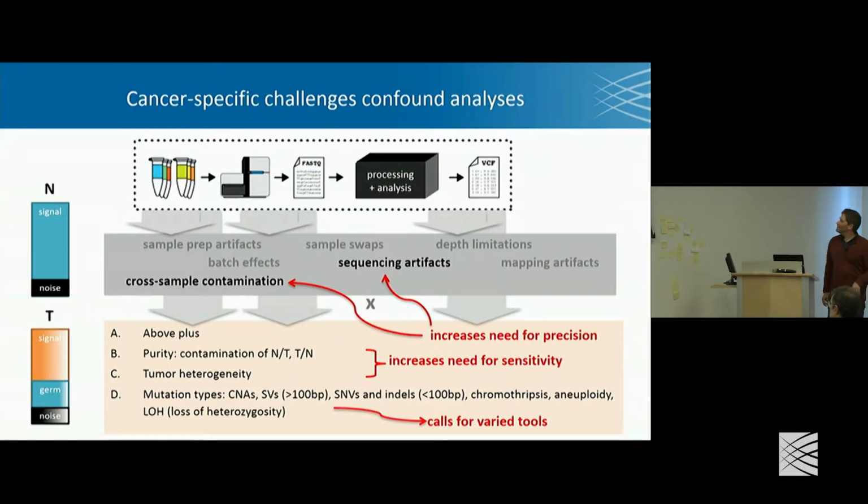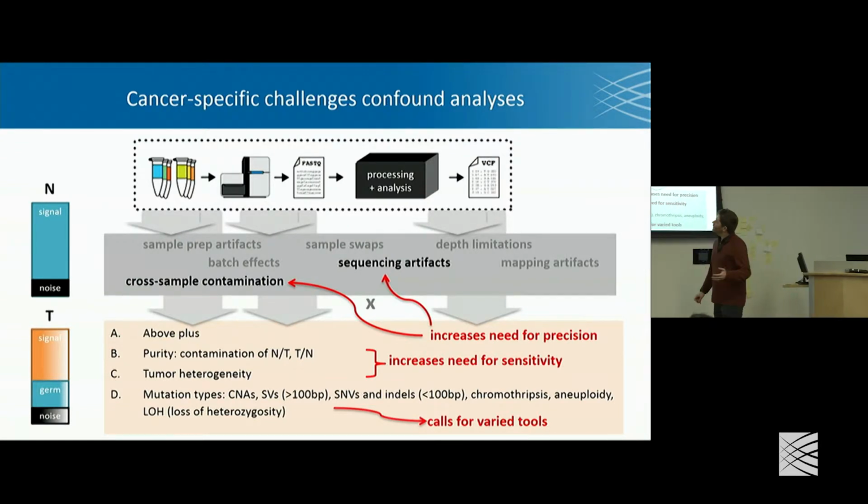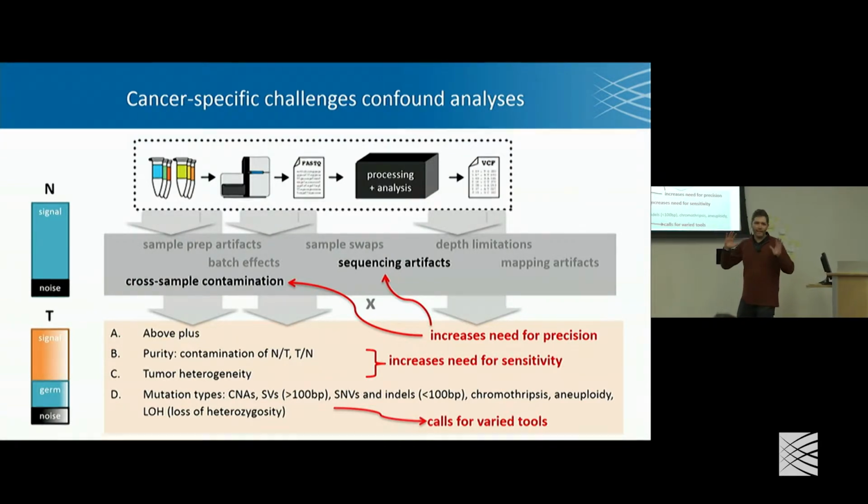Because of this, on the germline side, there are artifacts that they don't have to worry about because they affect a small number of reads. Typically, if you're looking for a high percentage of the reads supporting an allele, you don't have to worry because these artifacts or other issues only affect a small number of the reads. But when you're doing somatic calling, if you have 5 reads out of 100 or 3 reads out of 100, you may want to call that.